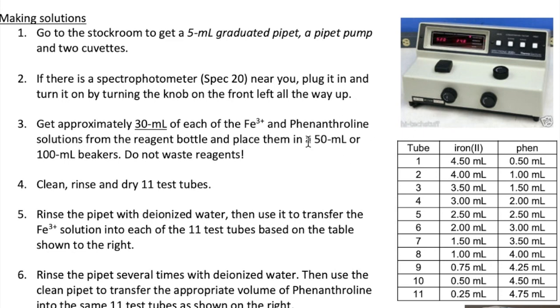Then use two small beakers to get approximately 30 milliliters of each of the Iron 3 Nitrate and Phenanthroline solutions. Don't get much more than 30 milliliters, as you'll only need that much for your experiment. Get 11 test tubes, clean them with soap, rinse well with water, and dry all the test tubes. Label the test tubes from 1 to 11.